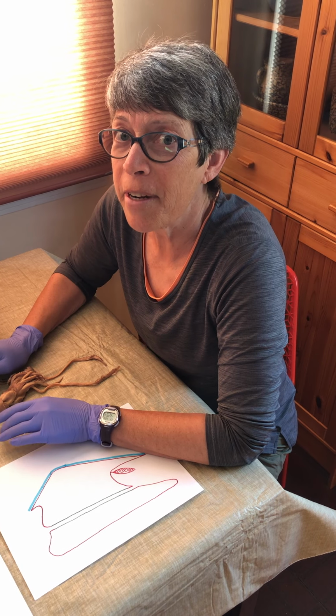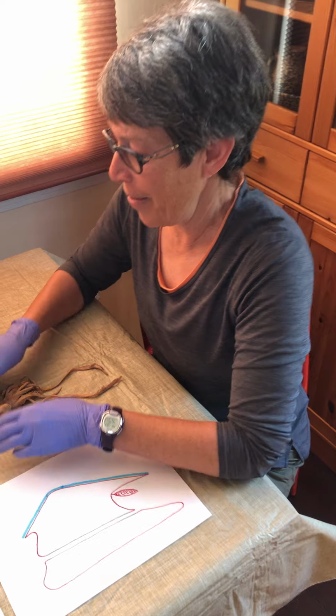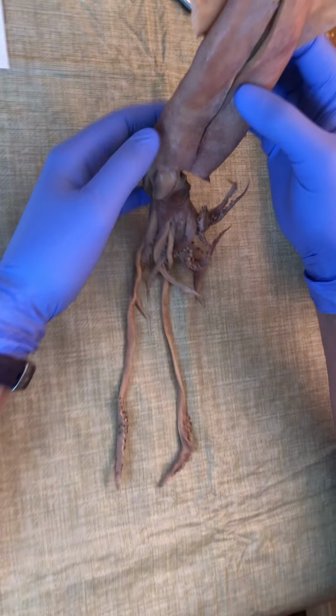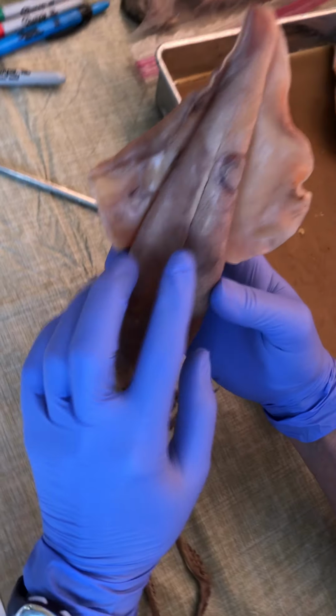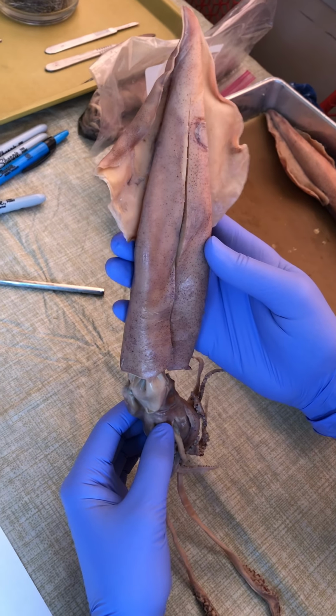If you're ready, we're going to do the anatomy of the squid. Woohoo. Hold on to your mantle cavity. Okay, so here you go. I've actually made an incision here. So I'm showing you, I'm just going to give you the tour, okay?